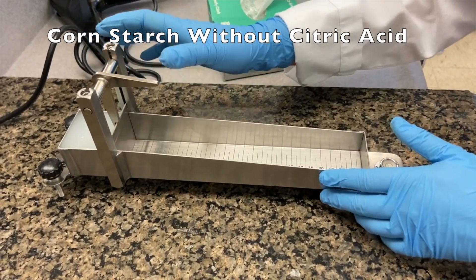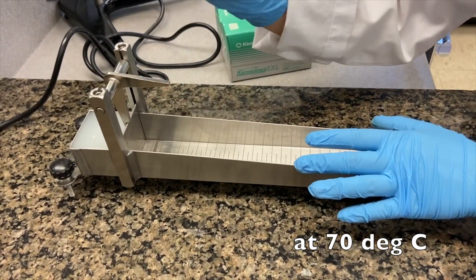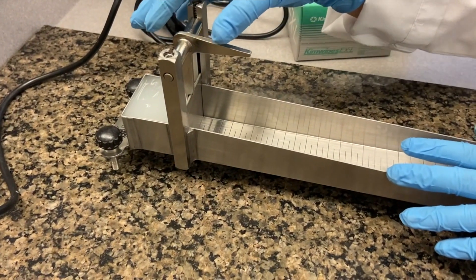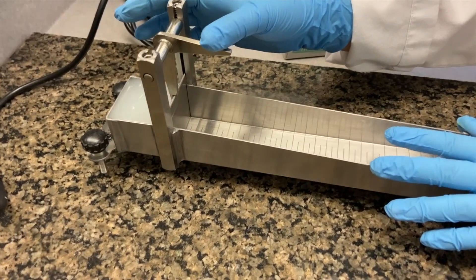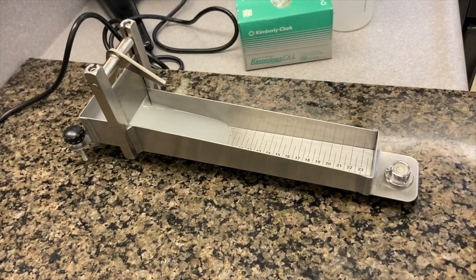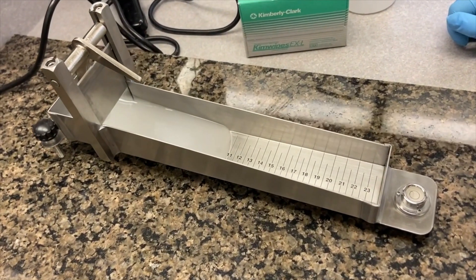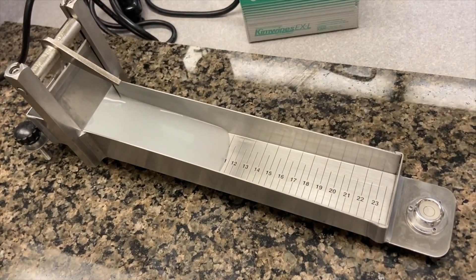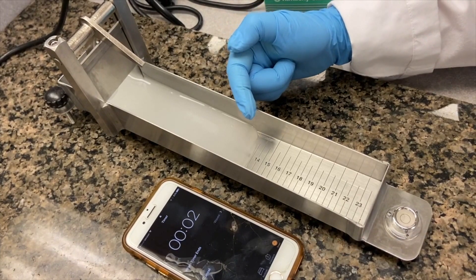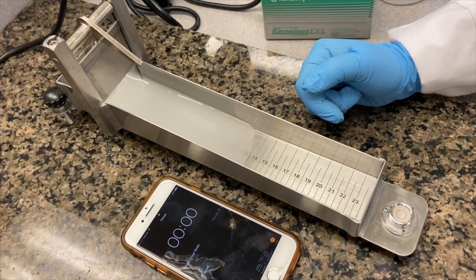This is the cornstarch sample without acid in the Bostwick. The reading temperature is 70°C — starting with 70 Celsius. I'll release it and start a timer for a minute. After the minute, you can see where it has traveled.